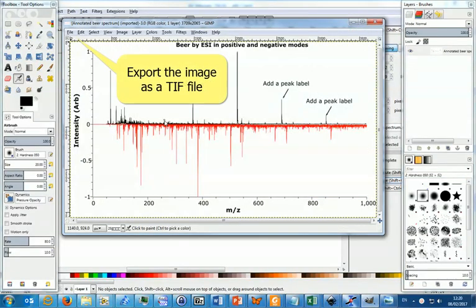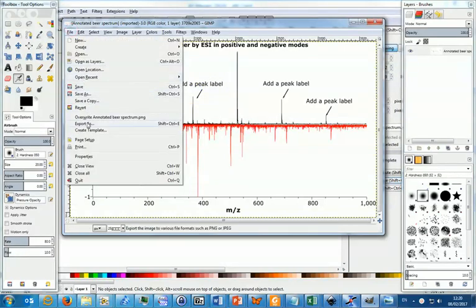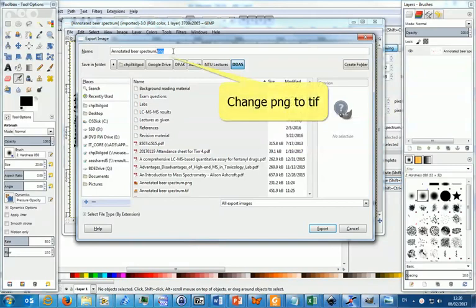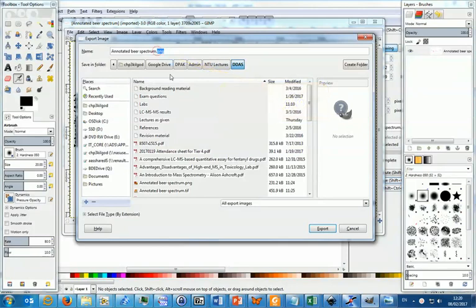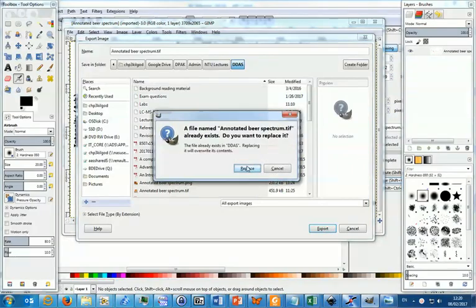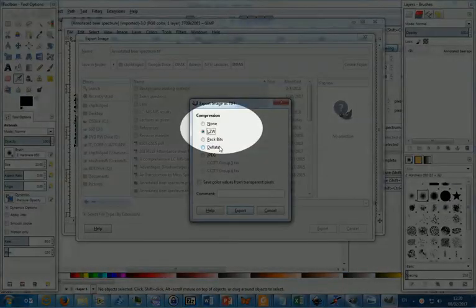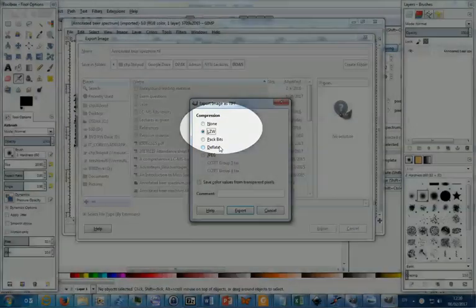To export the file as a TIFF image, go to the file menu and choose the export option. To export as a TIFF image, change the file extension from PNG to TIF.